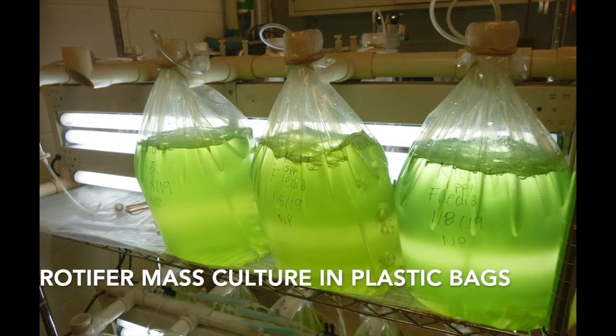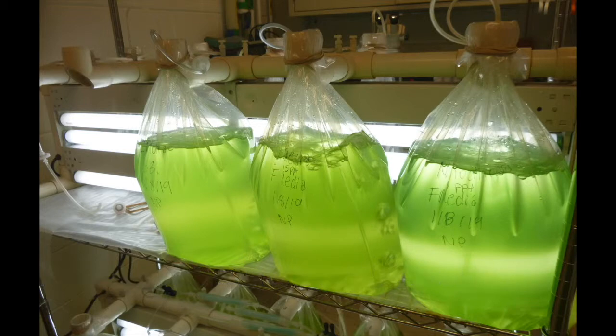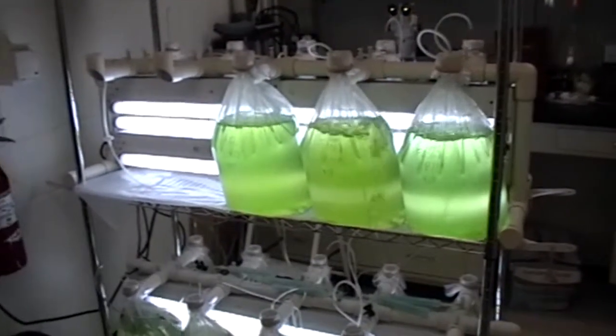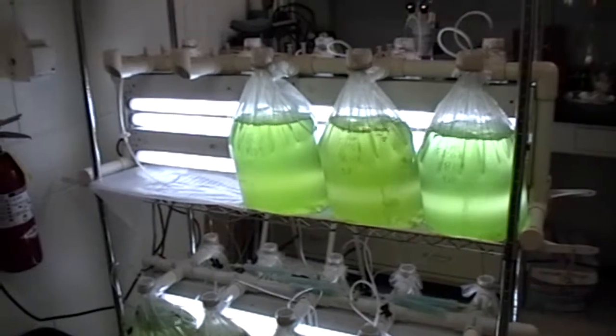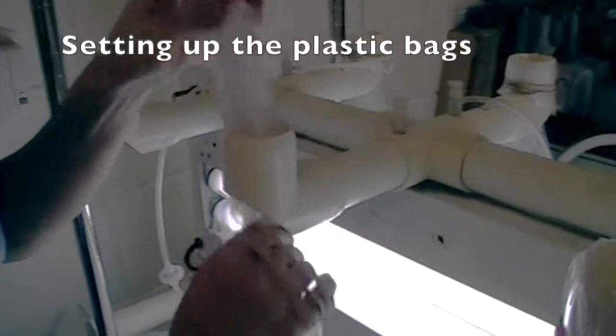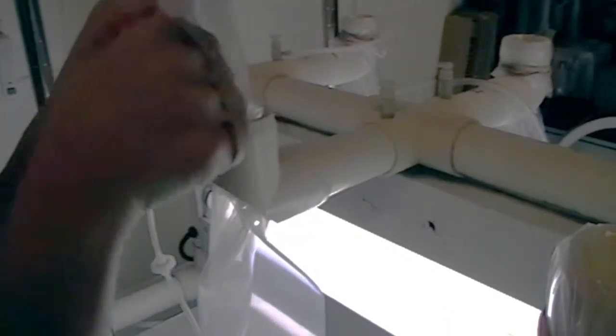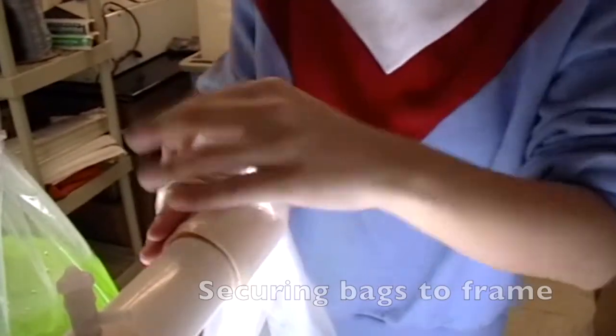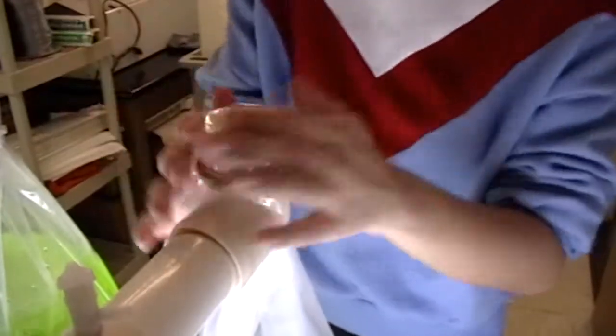A simple and reliable way to mass culture rotifers is to grow them in plastic bags. This example is for lab scale 5 to 12 liter plastic bags. We use a PVC frame with an air manifold that holds 10 twelve-liter plastic bags. Plastic bags are slipped through the pipe on the frame and then folded back against the PVC, and secured with four rubber bands to make sure the bags don't slip from the frame.